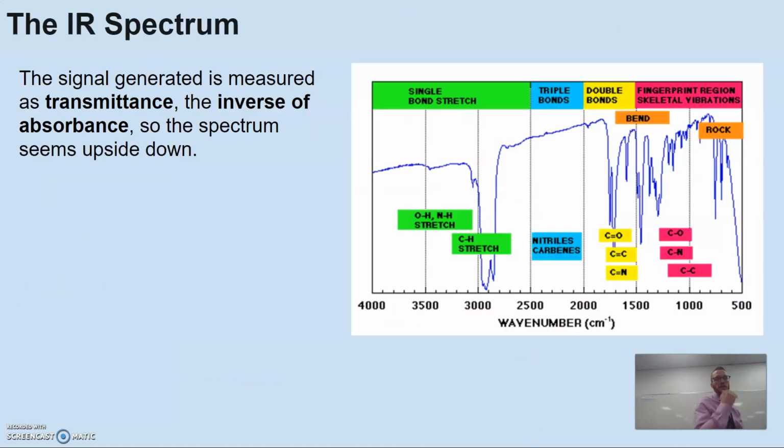Ignore that for a moment. Things I want you to notice. With infrared spectroscopy, unlike a typical graph, so mass spec goes from lowest to highest number. Notice what, well, let me just ask you, what do you notice that's different about a typical graph?